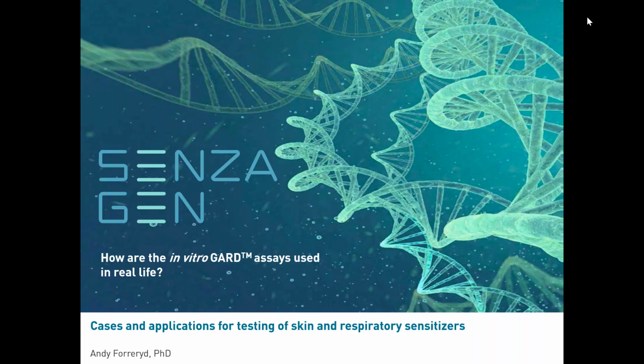I would like to start this presentation and welcome you all to this webinar called How are the in vitro GARD assays used in real life? Cases and applications for testing of skin and respiratory sensitizers. This webinar focuses on applications from 6 real cases and examples and challenges with solutions using the GARD assay and what SenzaGen can do for you as a customer.